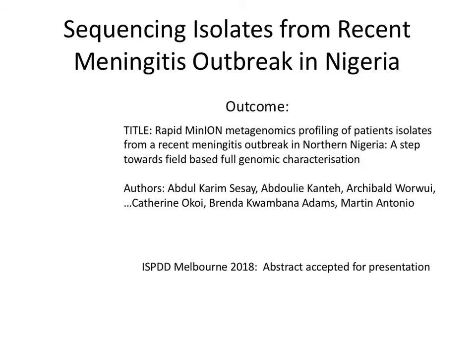Outcome. We've sequenced, and I was going to show you EP2M. I will show you, how much time have I used? My time's done. Yeah. So I will not, but I can show you data. Mark is not here, so I can carry on and show you the data on one of these. What we managed to do is sequence some isolates, and we were able to at least classify it as strep and some class of strep. I could show you that before, if Mark doesn't come in.